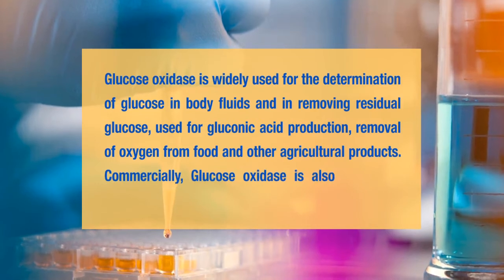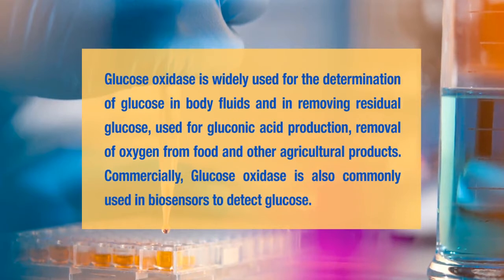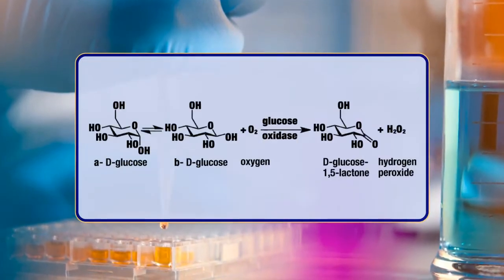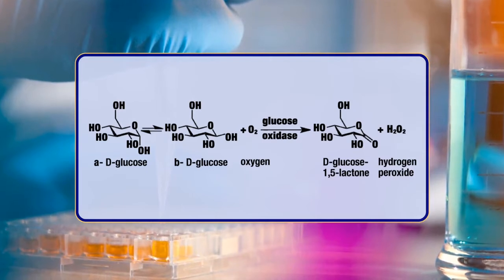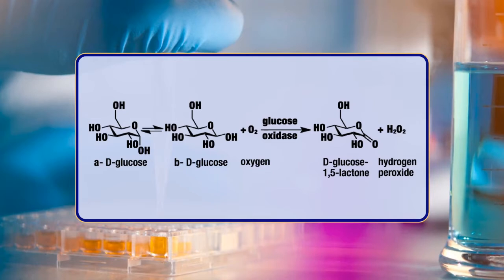Commercially, glucose oxidase is also commonly used in biosensors to detect glucose. In this experiment, our aim is to calculate the enzyme kinetics parameters such as Km and Vmax of an enzyme, glucose oxidase, using glucose as substrate.